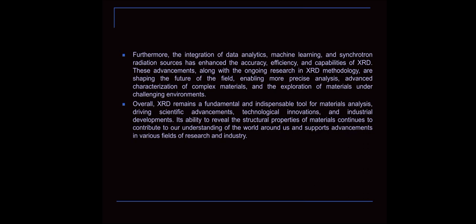Overall, XRD remains a fundamental and indispensable tool for material analysis, driving scientific advancements, technological innovations, and industrial developments. Its ability to reveal the structural properties of materials continues to contribute to our understanding of the world around us and supports advancement in various fields of research and industry. This is a diagram.